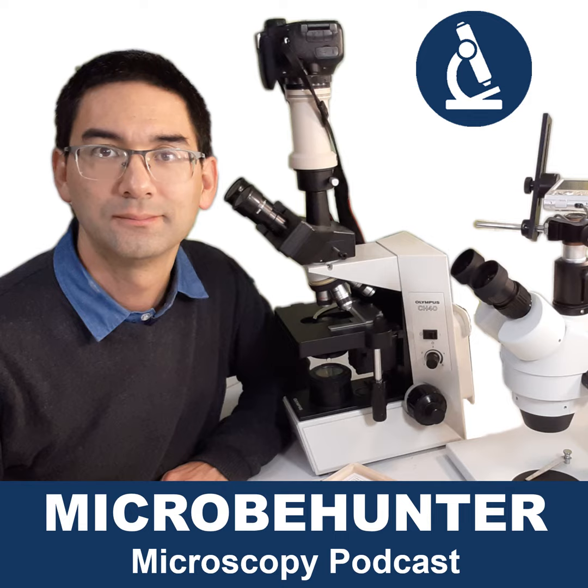The fact that the light rays are parallel before they pass through the tube lens has another advantage for some applications, namely that you can build the microscope pretty much any size that you want. This allows manufacturers to build microscopes of a larger size. With a 160mm objective, you had to take this focal point of the 160mm into consideration. Now with the infinity optics, it is possible to extend the tube as much as you want. Then you just add the tube lens, and this focuses the light rays back down to a point. So you're much more flexible concerning the size of the microscope.